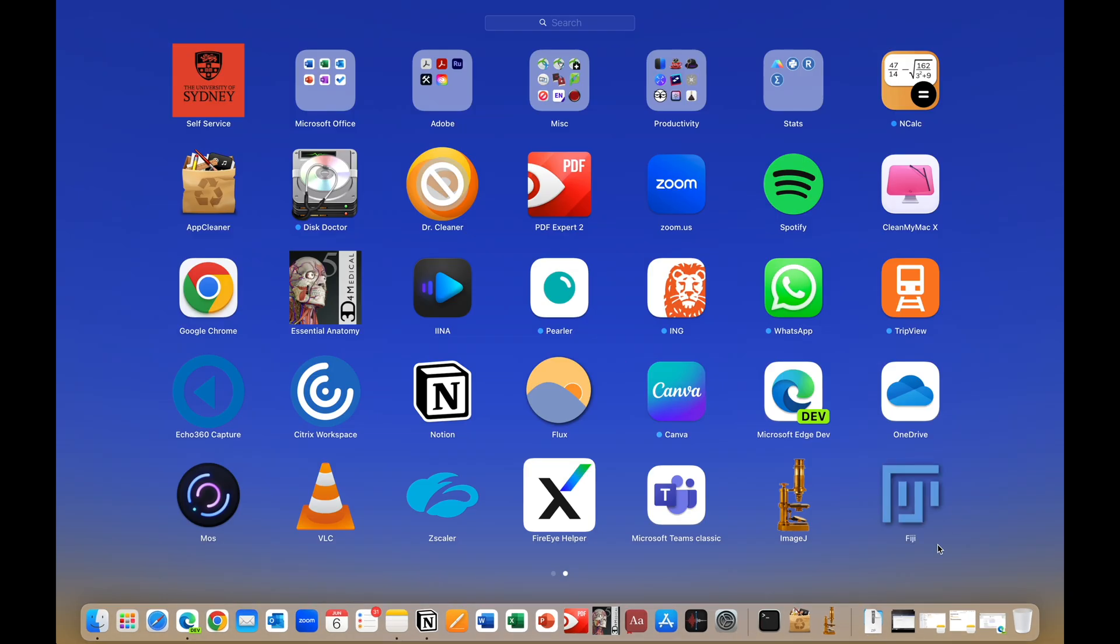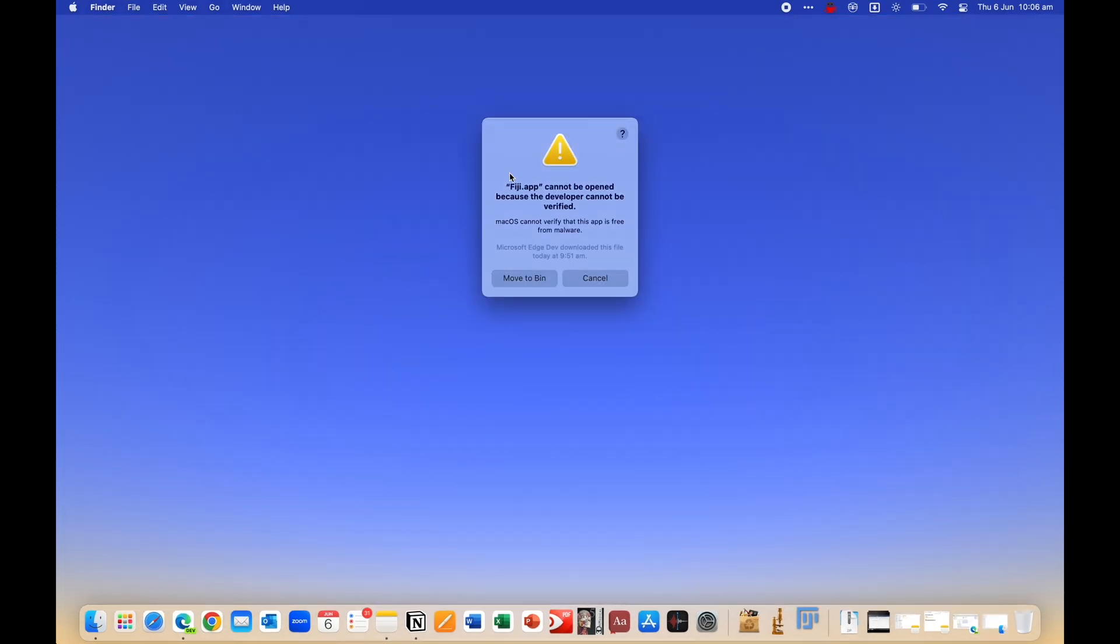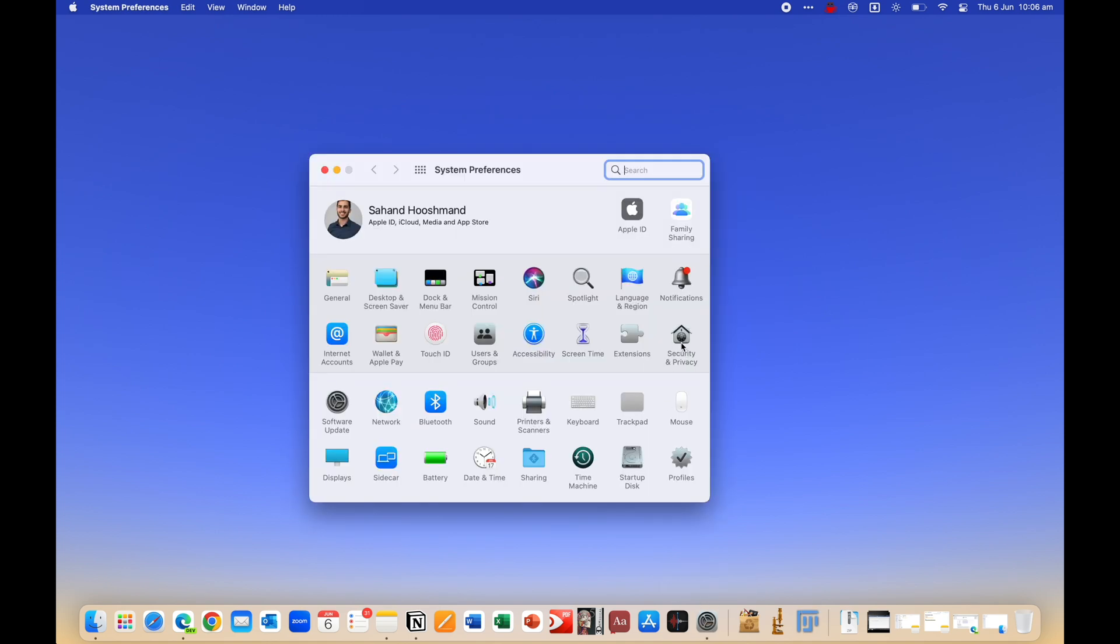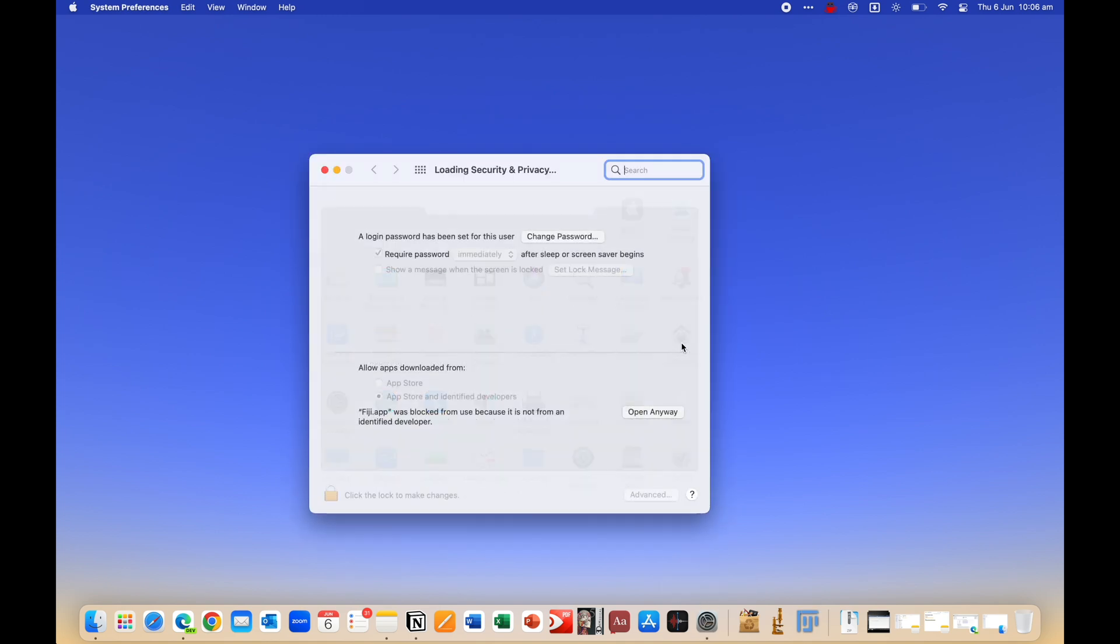Anyway, so once you open it up, ignore the error message, just go to settings, security and privacy, and then click open anyway.